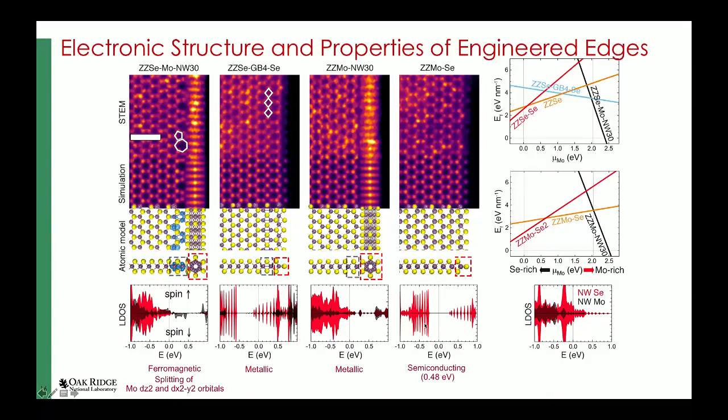conducting nature. So why am I showing this? Why am I trying to go into a lot of detail of how we can rearrange atoms? Well, like I said earlier, if we know the structure and chemistry, and we have the ability to tune it, we can change the properties significantly. So this example basically shows how we can take a material, transform it in the microscope, and obtain new structures and relate that to new functional applications.